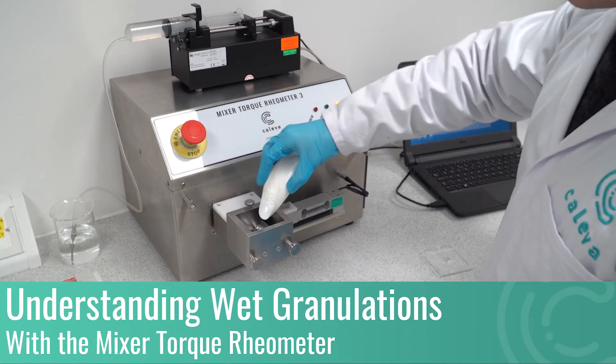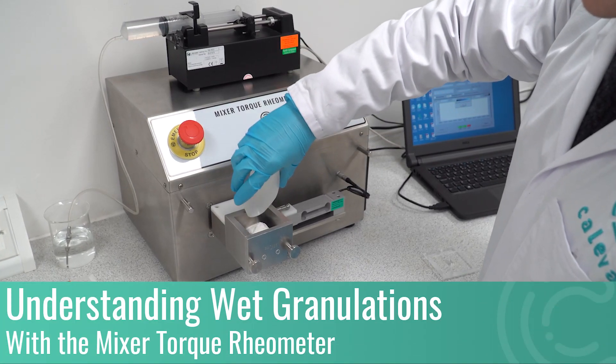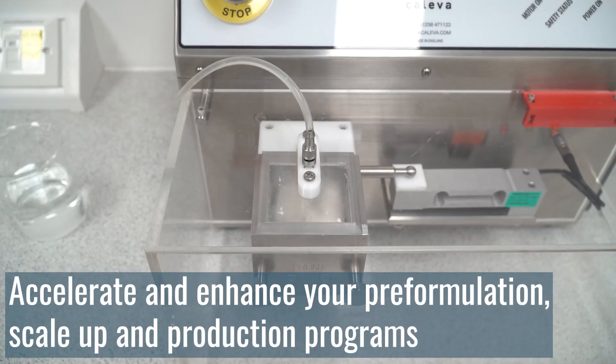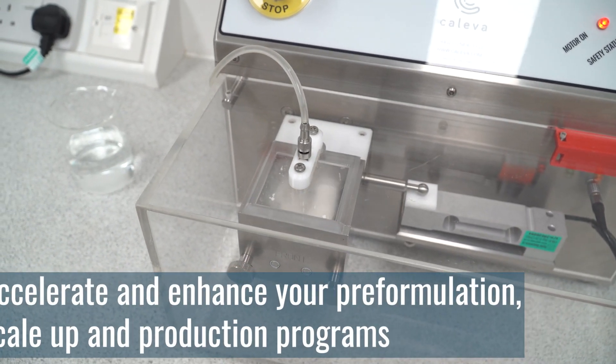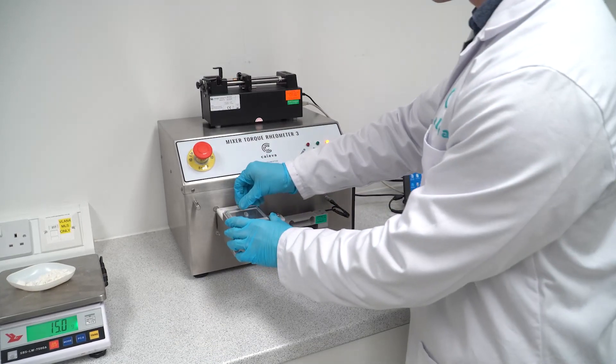Are you working with wet granulation for tableting, extrusion or spheronisation? Obtain quantitative data to accelerate and enhance your pre-formulation, scale-up and production programs with the Klever Mixer Torque Rheometer.